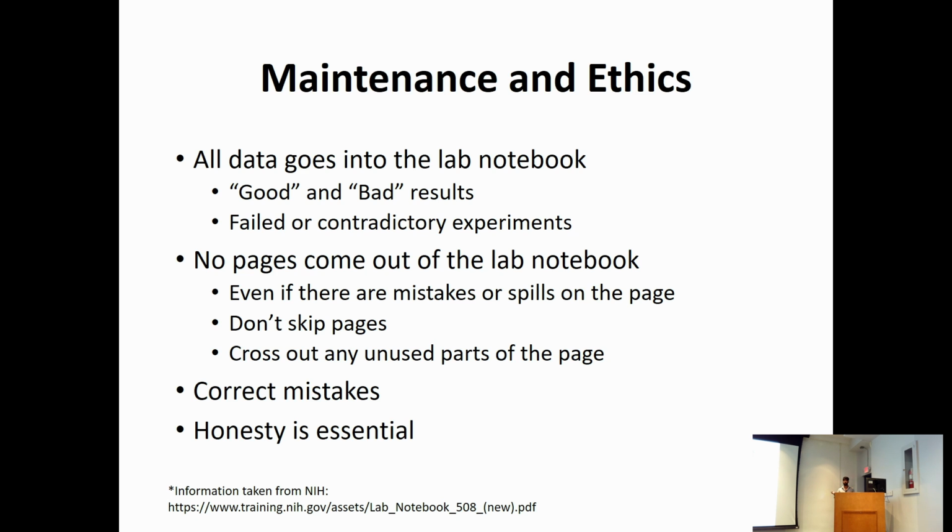then they will get to the good results. For me, in my experiments, I was struggling for 6 months to get good results. Which means if I didn't document it, I would never get the good results, because from the bad results you can gain some experience, right? You can get to know why it is bad, and you can change parameters, then stepwise you can go to good results. So it's better to document all the things, good and bad results.